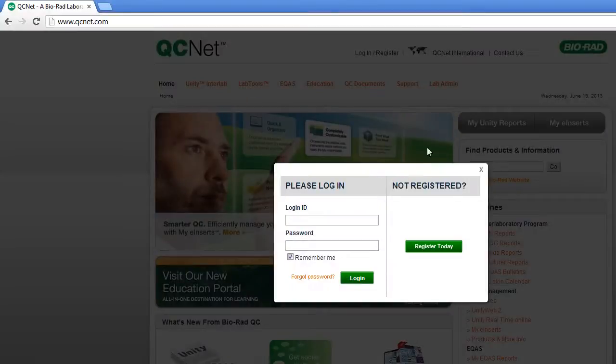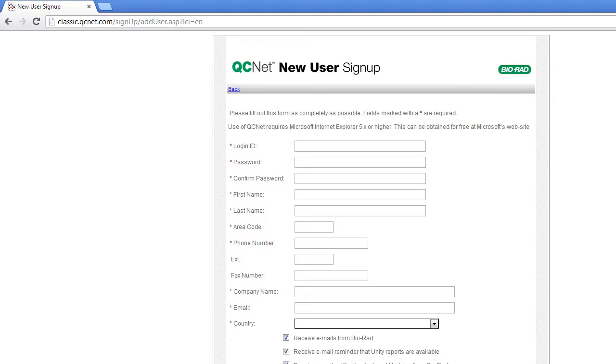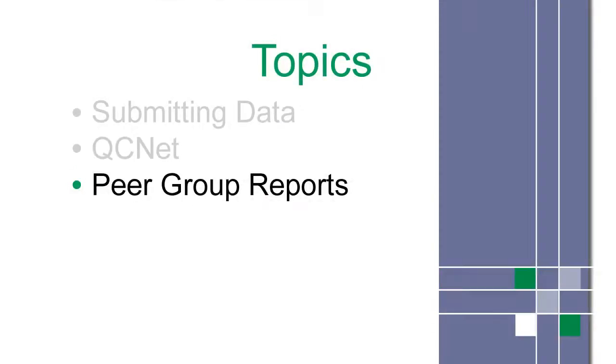New users must register. Completing this registration gives you access to QCNet. After purchasing the software, BioRad associates your primary user with a lab number. This allows them to assign access. Now that we are logged on, let's access peer group reports.